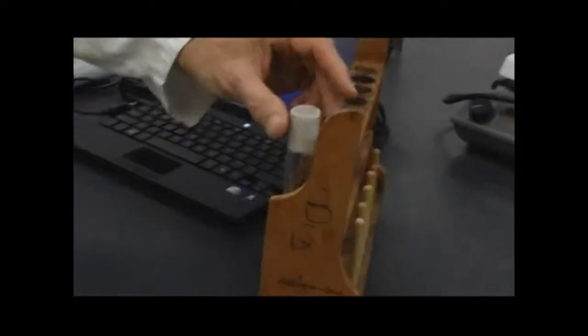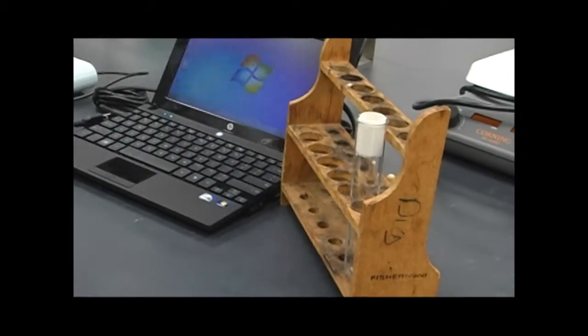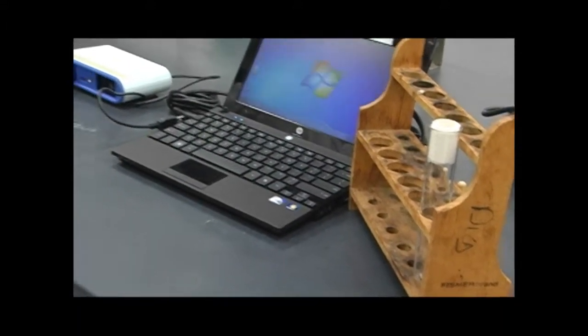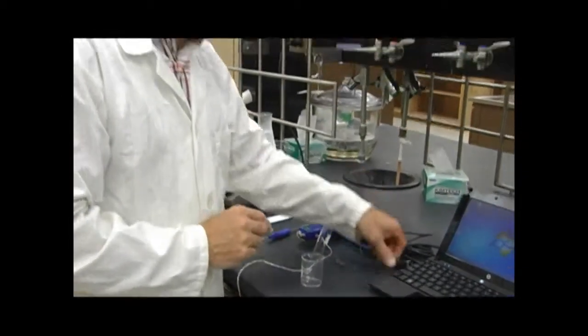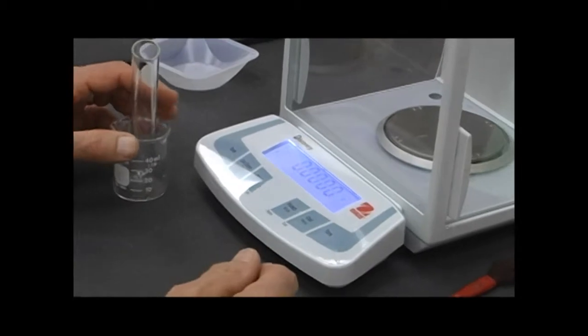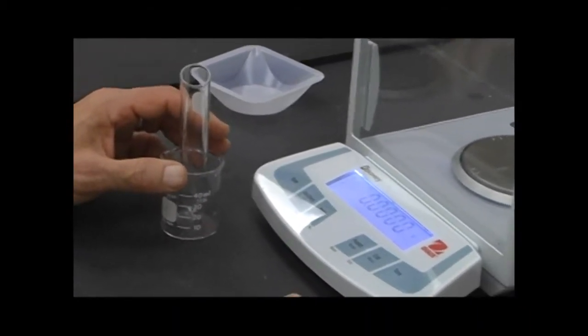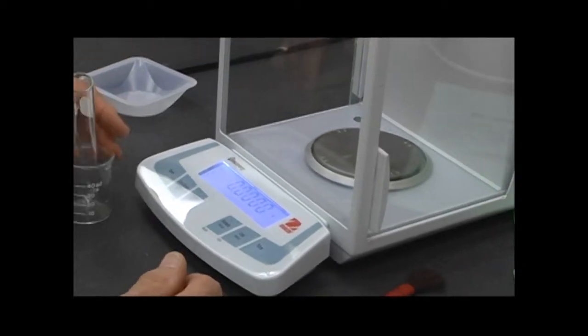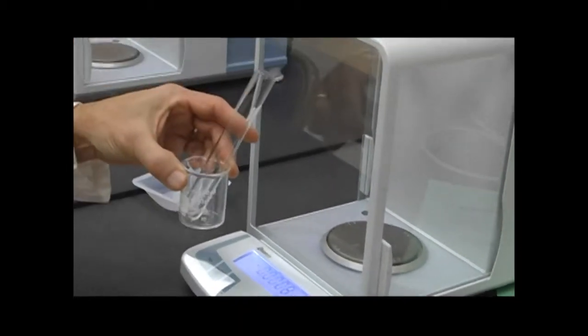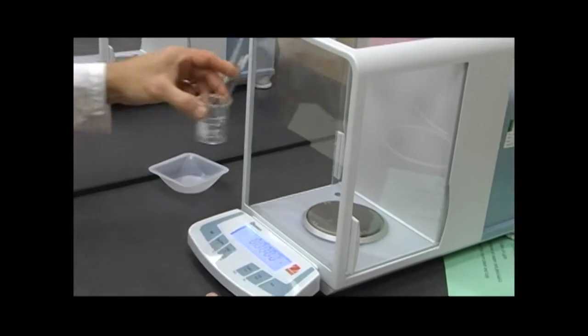And you can set that aside, and then we will go and weigh the empty glassware to determine how much lauric acid we have. As usual, you're familiar with weighing substances, so turn on the balance. You've obtained a beaker and the smaller inner test tube.